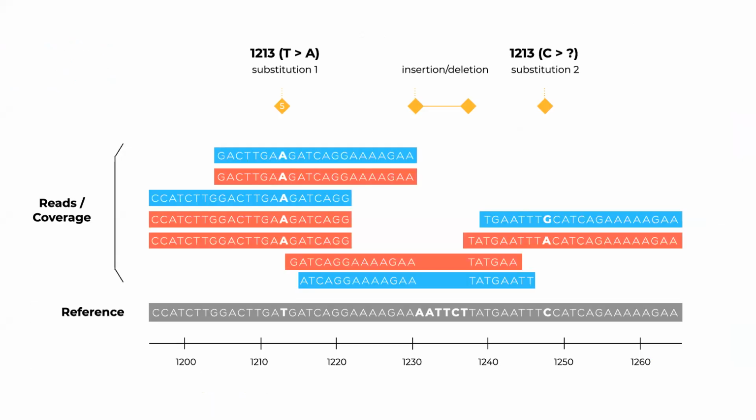And we'll actually talk about the significance of variation inside those reads and how those are detected to be actual variants and not random technical issues that are caused by the instability of the process of next generation sequencing.